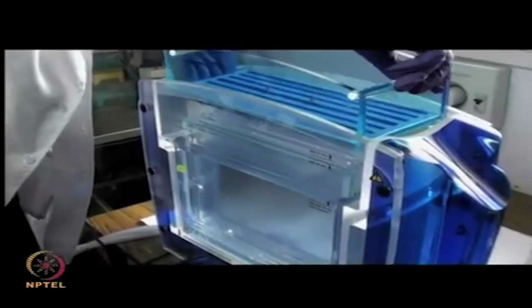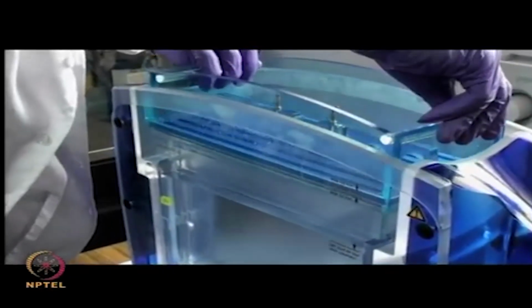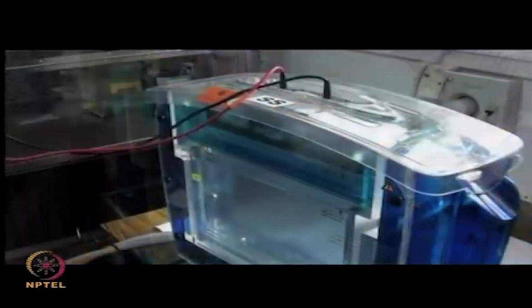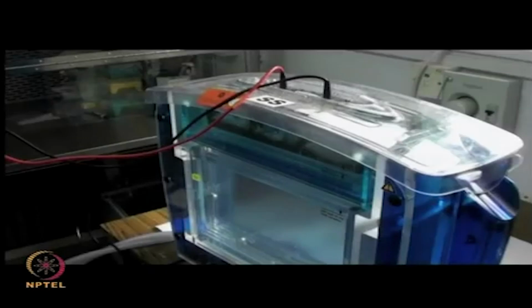Place the separating chamber above this and pour the buffer solution into the upper chamber. Close the gel assembly and connect the apparatus to the electricity supply. Set the appropriate voltage and begin the run.